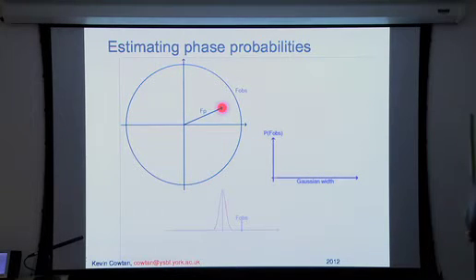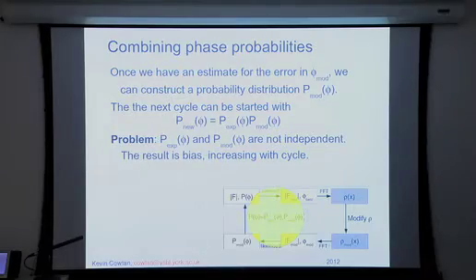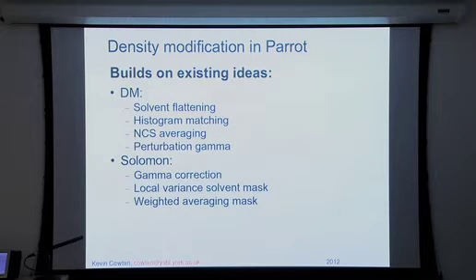So that's how likelihood allows us to estimate not just parameters but uncertainties in those parameters. And your uncertainties are always a vital part of your knowledge, so that's important. I don't think there's anything else. We'll skip the rest of that.